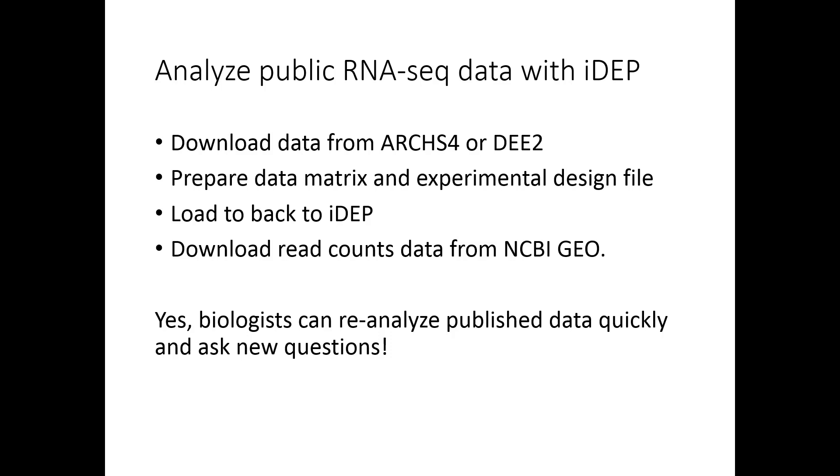Hello, my name is Xijing Ji. I'm going to show you how to use iDEP to analyze public RNA sequencing data.